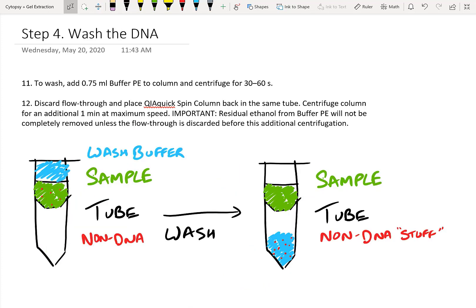Our next step after the initial spin and binding is to do a wash using PE buffer, which contains ethanol. We add the PE buffer to the top and centrifuge it so it washes through. Anything that's non-DNA — such as ions or buffer elements remaining from electrophoresis — comes out along with the PE wash buffer. Your sample is still inside the column, just a bit cleaner now.